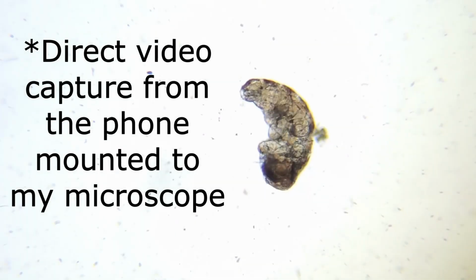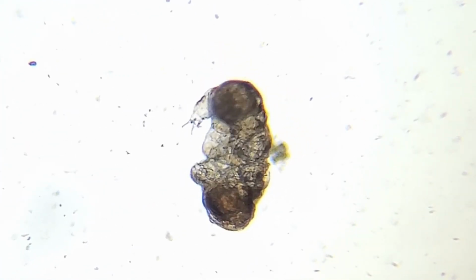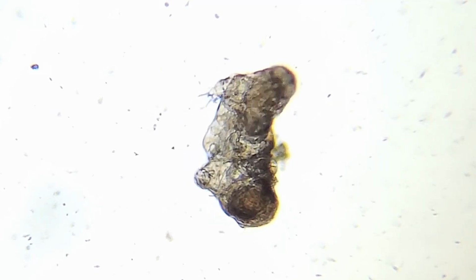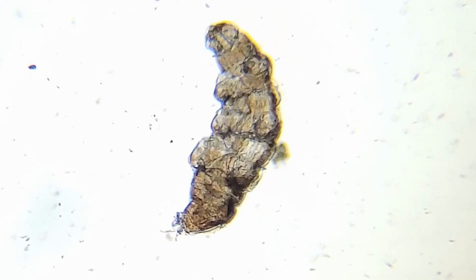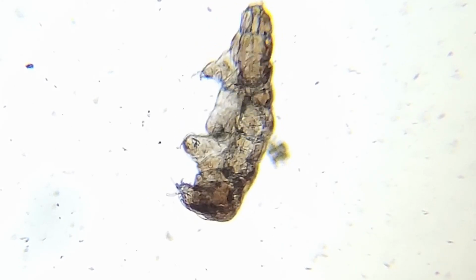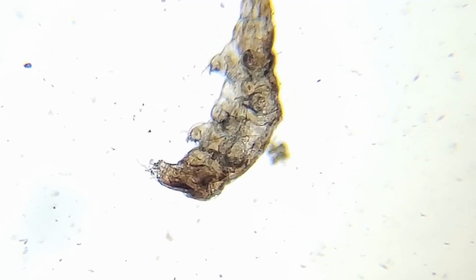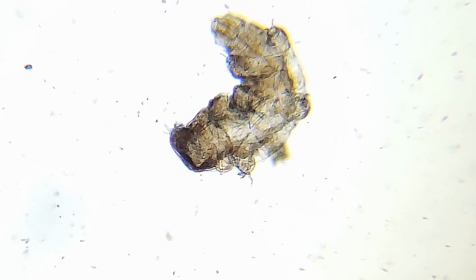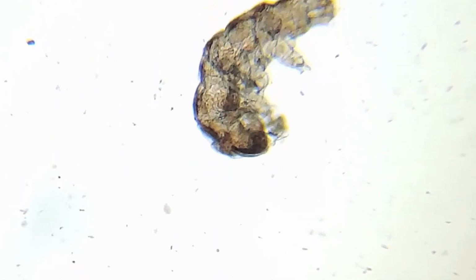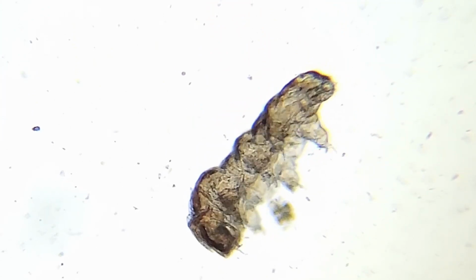Most tardigrades are actually vegetarians, so this little guy's probably just eating algae or little plant matter that he can find. Just a 3D stage. There, you can see his digestive tract a little bit better now. Tardigrades have 8 legs, so they're basically 2 bears squished together, like a smushed together little gummy bear. They're so cool and so cute. I've always wanted to see one of these in person from a wild sample. I've just never had the ambition to get out and do what's necessary to find one of these guys. Oh, there's his little eyeball there.